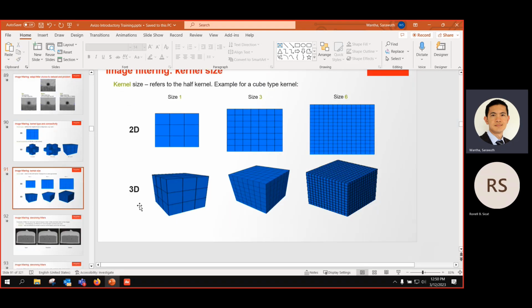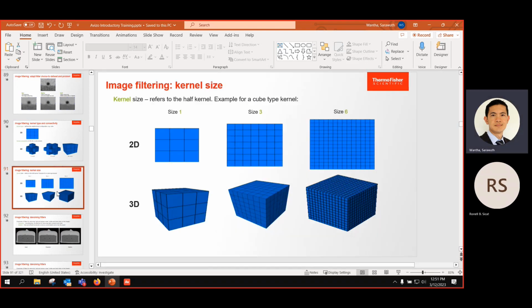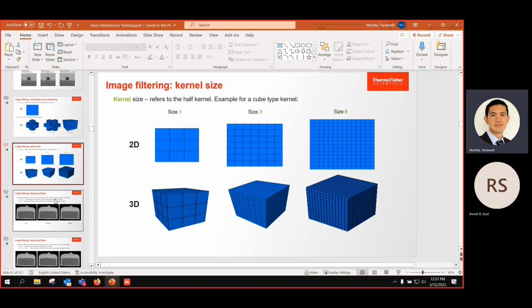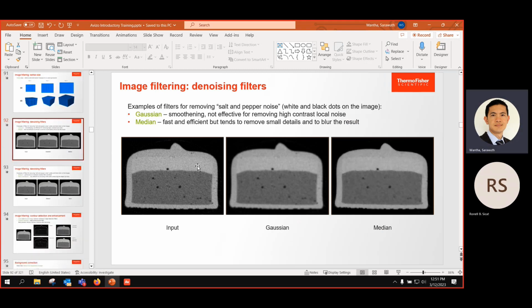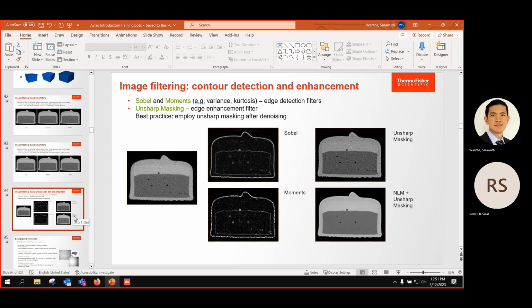And here, like, filter canals, so in 3D, you can see that is some example of the filtering. So you can input here, and you apply Gaussian and median, it looks the same, but actually median does a much better job because Gaussian is just blurring, but it doesn't really preserve information. Median is always recommended, not the Gaussian.